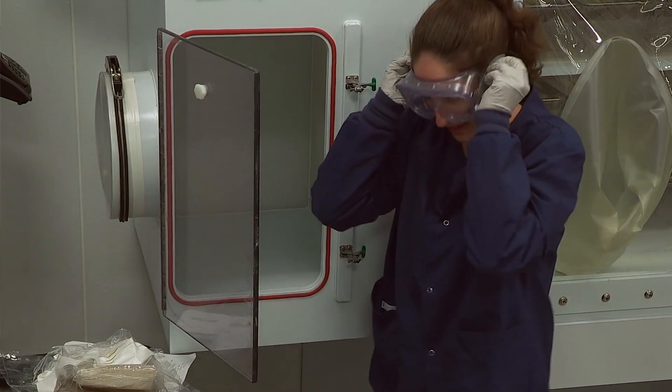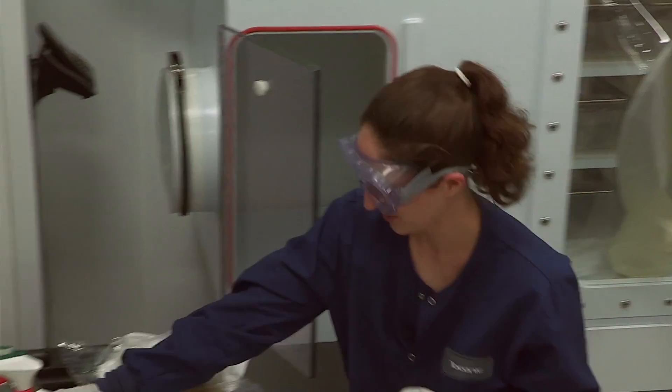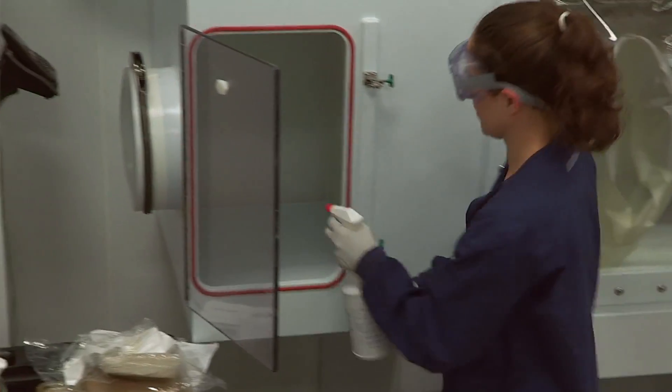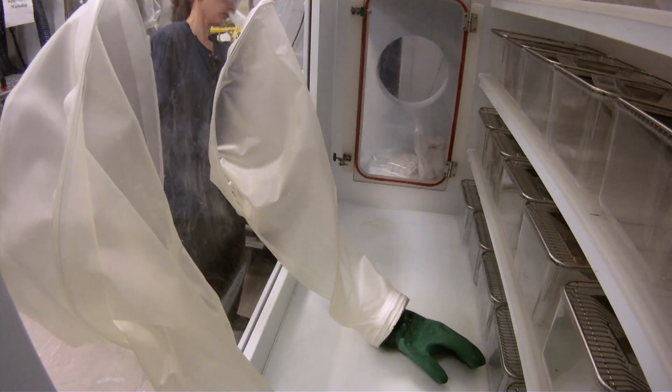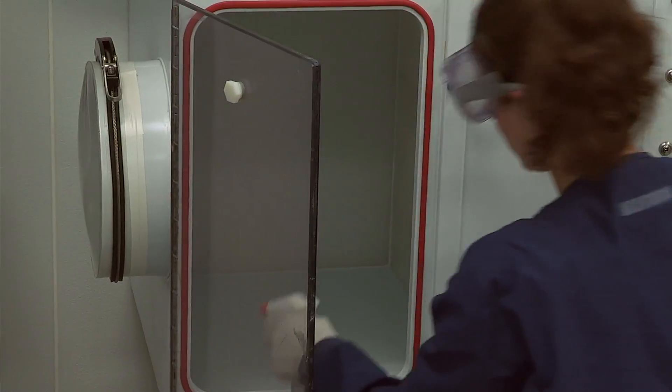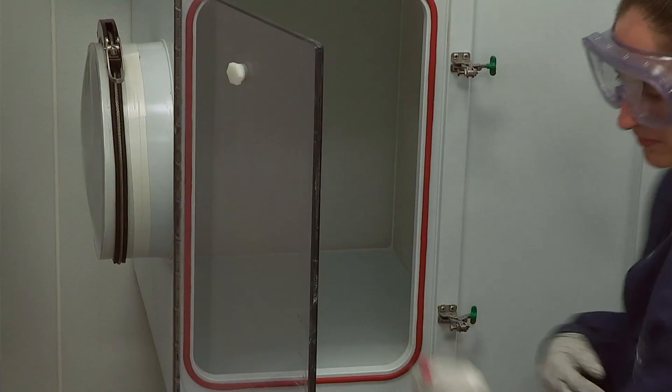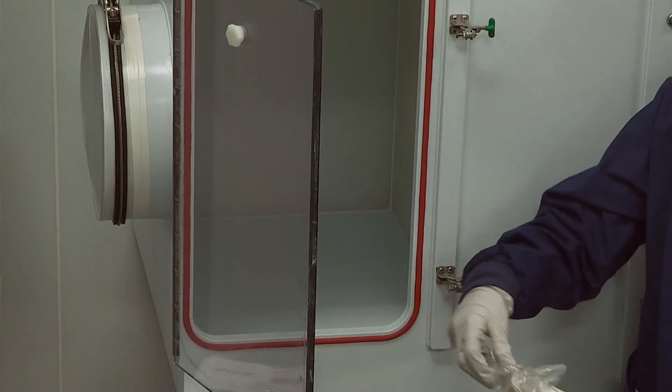When we're entering supplies, you always want to be safe and wear safety goggles. I'm going to take my cold sterilant and spray down the interior of the port, and then we're going to spray off each supply individually.